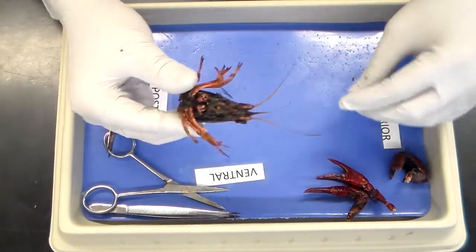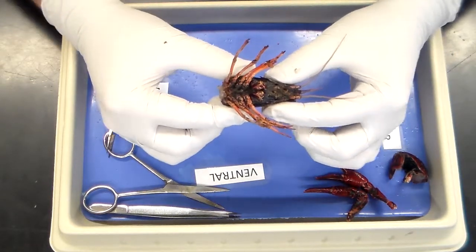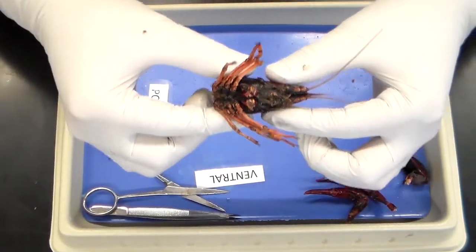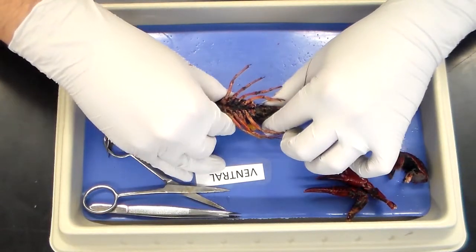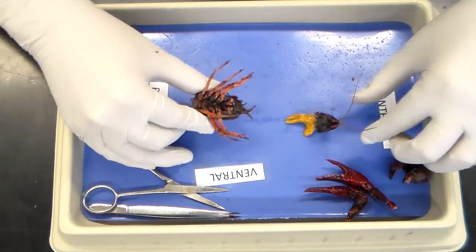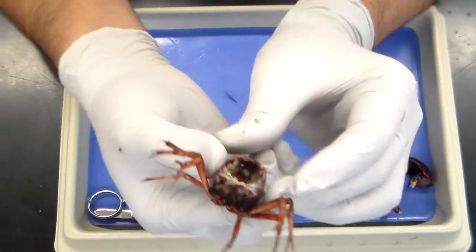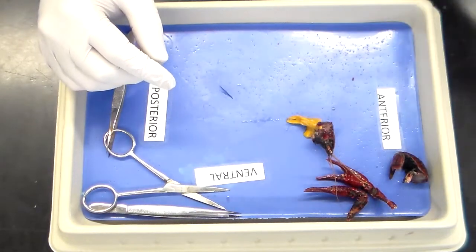Flip the crayfish ventral side up. Grab the head with one of your hands, the thorax with the other, and you are going to pull down and out. You should be able to see the heart beating, and we're going to immediately place this in saline solution.